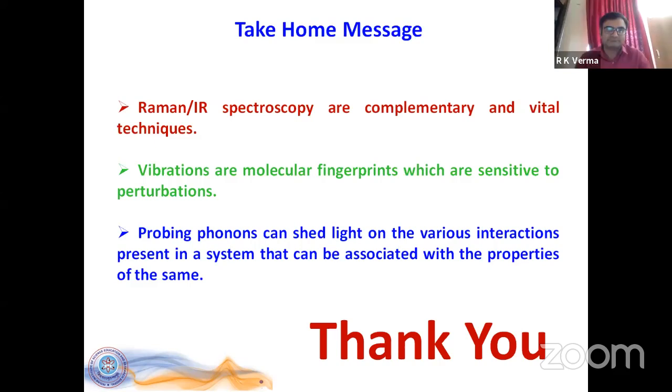If, for example, the sample has a band gap which is close to the laser wavelength that I'm using, I may use a laser which is lower than the band gap, a laser exactly equal to the band gap of the material, or a laser which is higher than the band gap. In those cases, what happens? Some resonance processes will come into play.